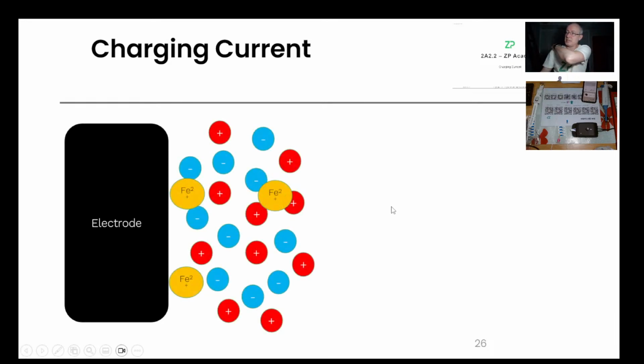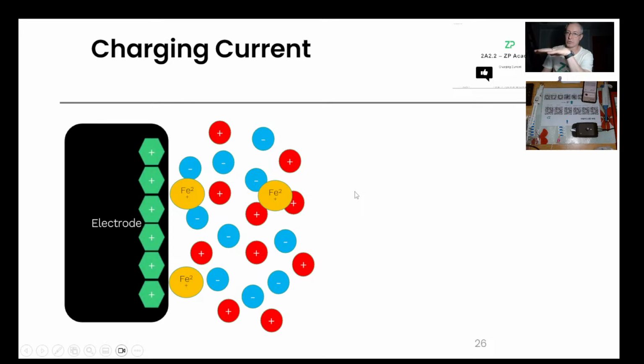Well, they exist because if I'm trying to do the oxidation of ferrocyanide to ferricyanide, I've got this solution on my electrode, and I turn my electrode on, or I change the potential. Every time you change the potential, in linear sweep voltammetry, square wave voltammetry, differential pulse voltammetry, cyclic voltammetry, voltage never changes these days in a linear fashion.